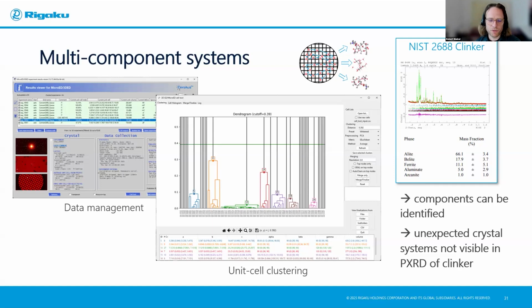It's rare that you don't find any way of preparing it, but sometimes it needs a few runs. With more practical experience for different sample classes, usually these will be fewer and fewer. It's not like in cryo-EM where you spend half your PhD thesis optimizing grid loading. Thank you.